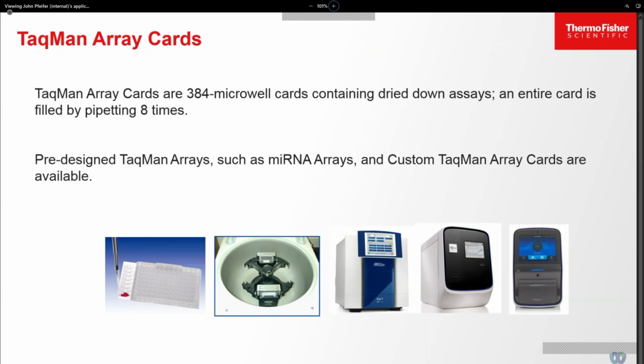So there are 384 microwells. Each well is 1 microliter approximately in volume. And they're initially connected with microchannels. So you would take one or more samples. You could have up to 8 samples, depending on the format of your card. And you'd have sample, like cDNA, for example, mixed with master mix, and apply that to fill ports. So on the left, I don't know if you see this, this is a picture of one of the cards loading the sample master mix mixture. Not really. They put red dye in there, but that way you can see what's being loaded.